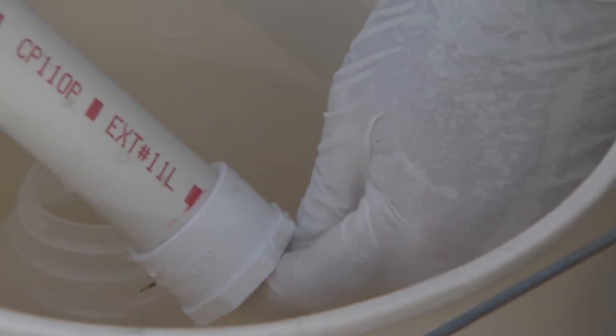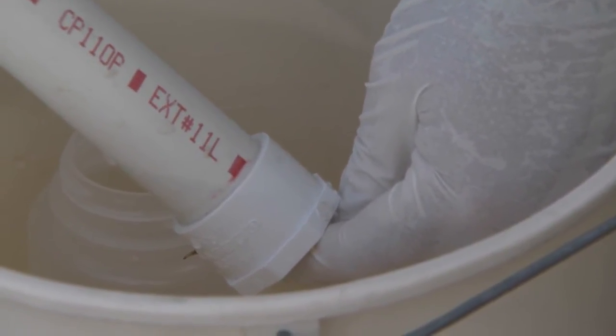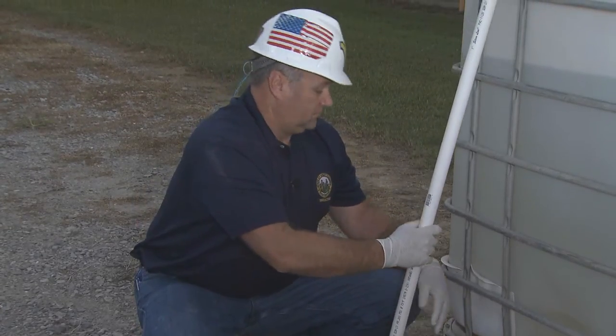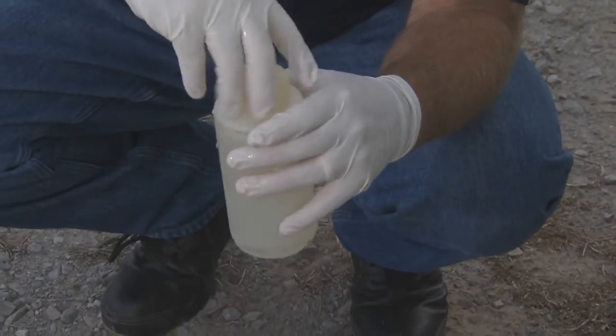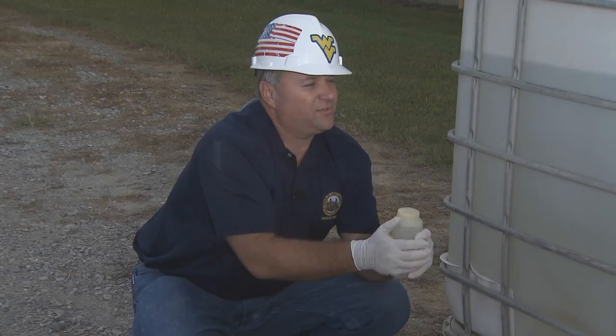You want to fill it about three quarters of the way full. Now I've collected your sample. Put your lid on, put your security tape over, and you have your sample.